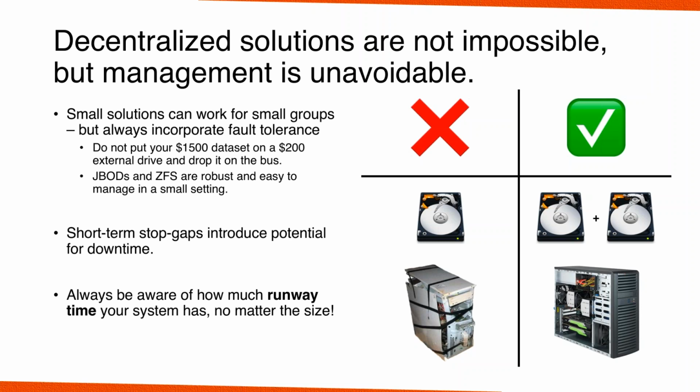Data loss in electron microscopy, especially if you're not done processing the data, is terrible. If you lose your data set, think about the technicians that prepped your protein, the students that designed it, the postdocs, everyone who's relying on your data or your structure. You don't want them to lose what they're doing, because that's what we're doing at the end of the day: we're enabling good science. We're enabling scientists to use this equipment, and if we have data loss, that's pretty much the actual worst case. So, no matter what you do, always have a backup copy of your data ready to go, or at least a redundant storage option.